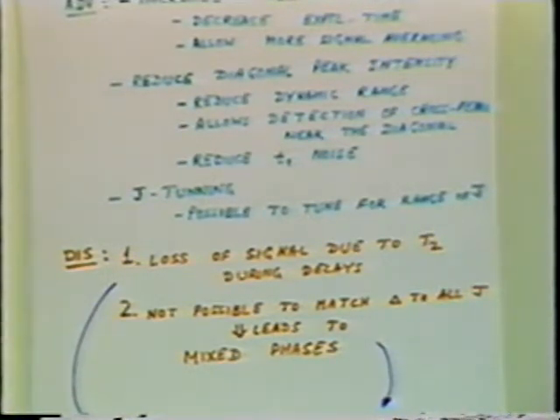I mean, it's so ever present, it's difficult to get rid of the T1 noise, and it's so strange I don't have a spectrum which I can show you which has the T1 noise at the moment. Anybody has yesterday's notes with them? I can borrow it and show you the T1 noise. Oh yeah.